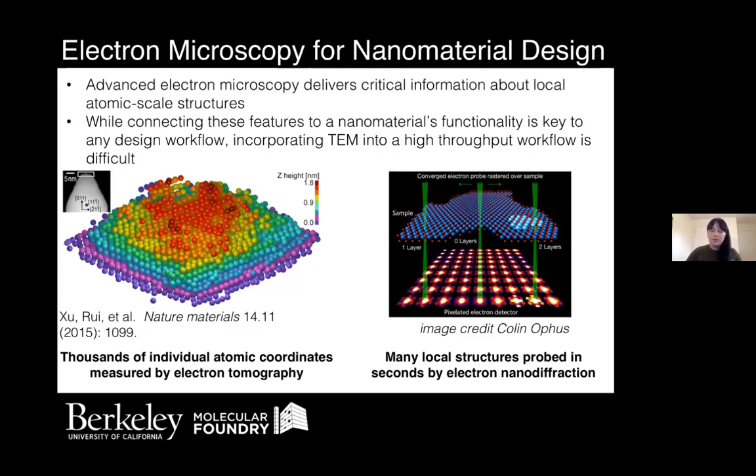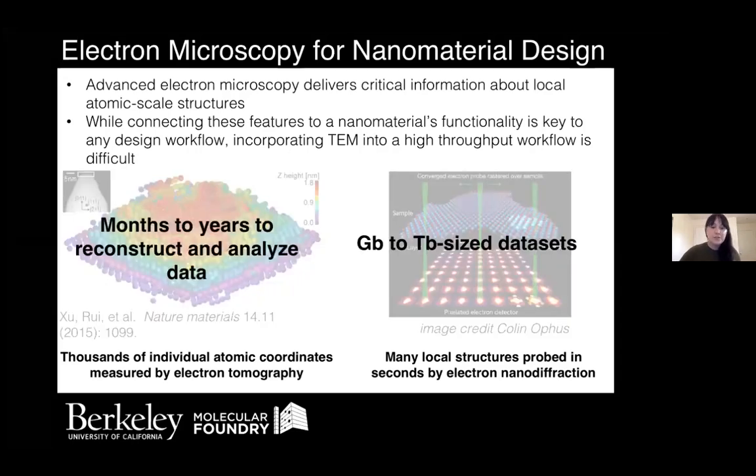So this is a wonderful imaging modality that's very sensitive to microstructure on the nanoscale and can be very multimodal in how you actually interpret those diffraction patterns that come out. So what is the drawback of these, what I'm calling, amazing techniques, and why are you not able to walk into a microscopy facility and push a button and have this type of analysis happen automatically on your samples of interest? The answer is really time.